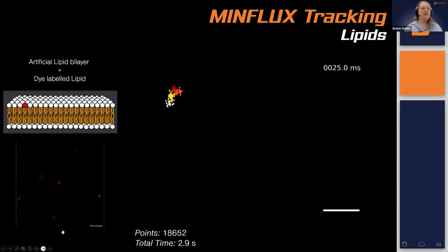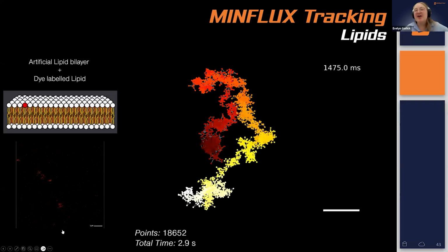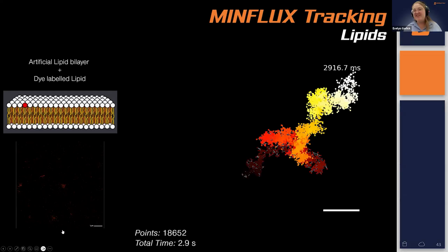So I have a video here that's a subsection of one of the videos. A video that's not playing, okay. So the video I was going to show you, you already saw, thankfully, in Xiaoyu's presentation, where we're localizing a molecule. And as it continues to move, we continue those iterations as it is moving across your region of interest. So we're continually localizing a molecule. So as long as it doesn't escape our search radius, we can just follow that continuously until it bleaches, or until it moves too fast and disappears out of our catch range.